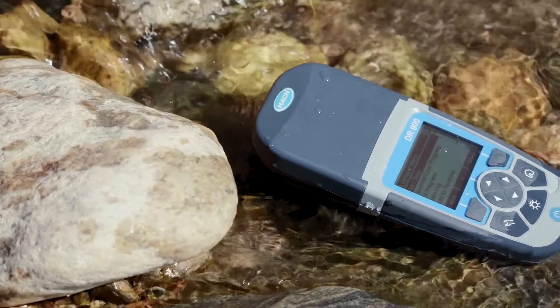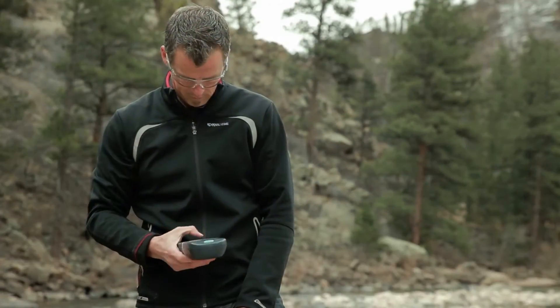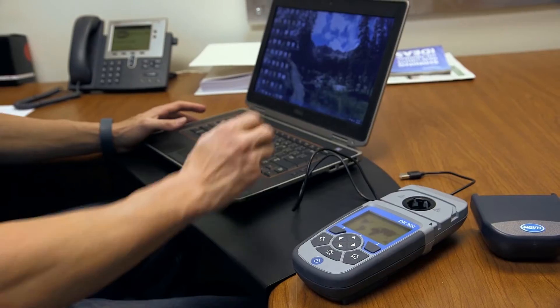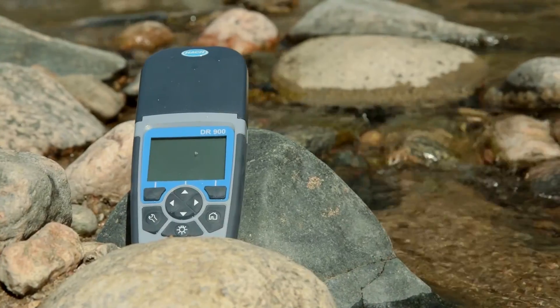The DR900 is built rugged for field use. You can test 90 parameters quickly and easily with one-hand scrolling, and store data for a secure upload to your data management system.